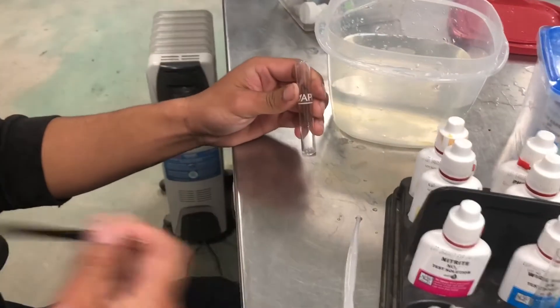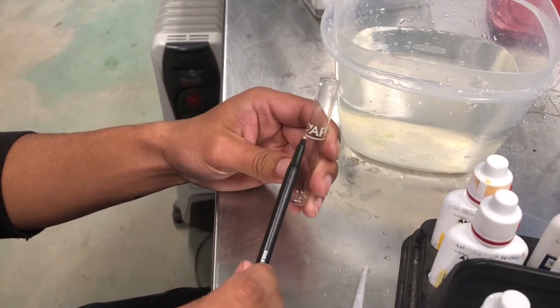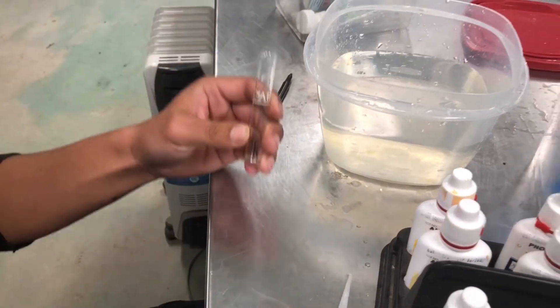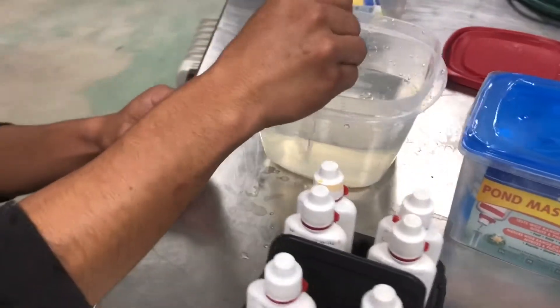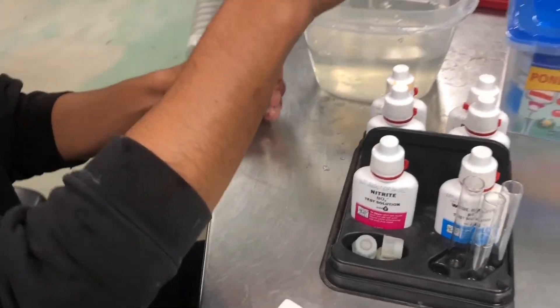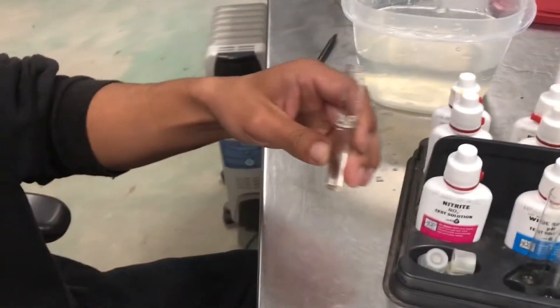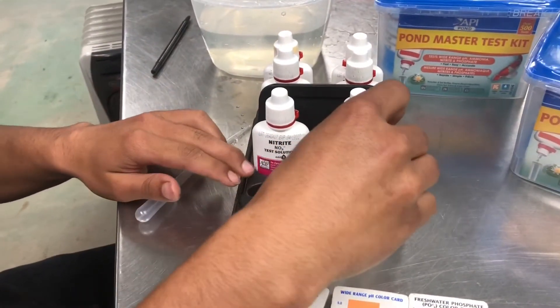So what you want to do, they come with these vials, and you can see there's a line right there. We want to fill up the water you're going to test with up to the line. So, and there's going to be four vials, so fill up the four vials up to the line with the water that you're going to be testing for.